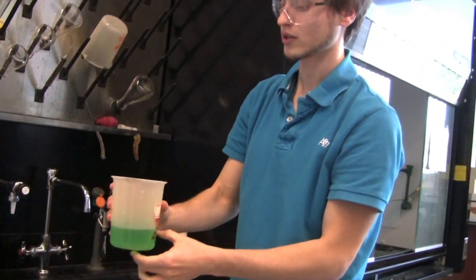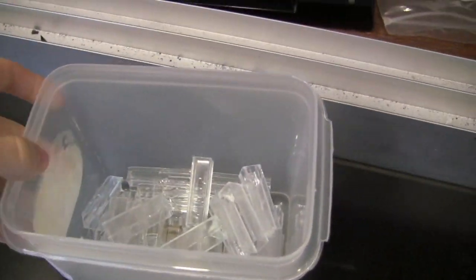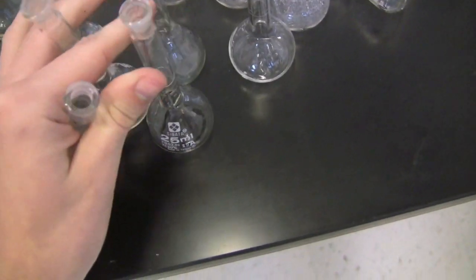Take your waste beaker and pour it into the heavy metal waste since it contains heavy metal. After putting up all your materials, including your volumetric flasks, wipe off the counter and make sure your area is completely clean.